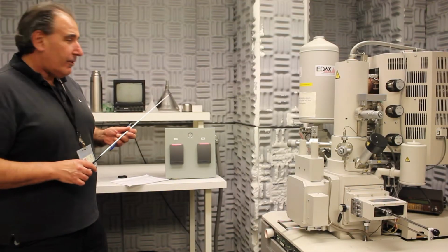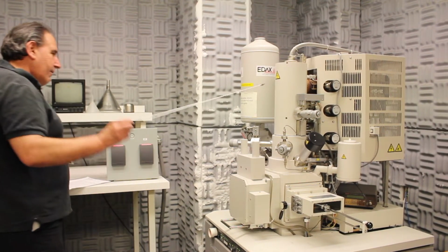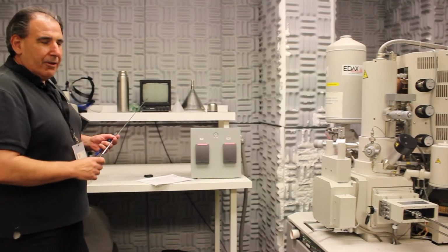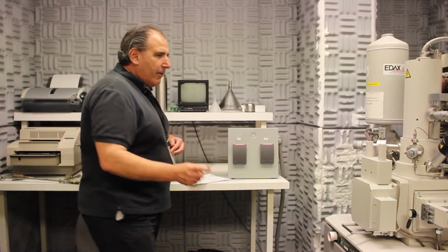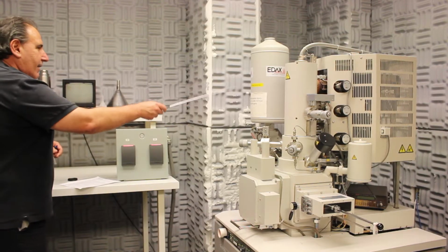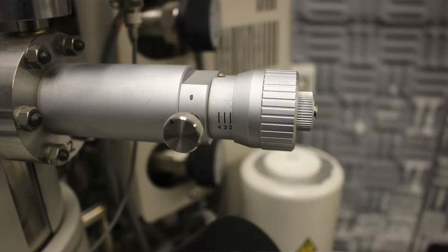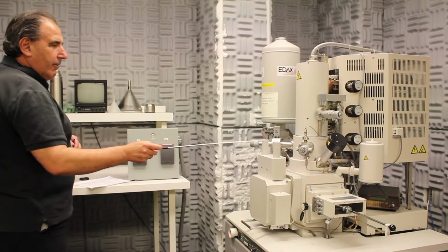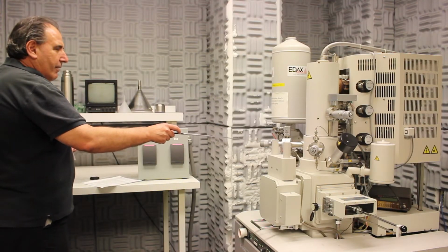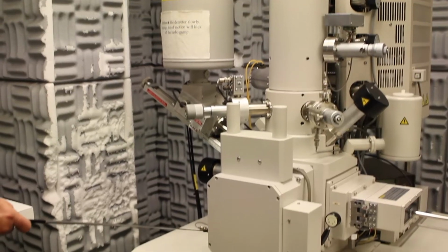Alright, checking column defaults. This is the cold trap, which we don't use anymore. The infrared camera back here and the monitor need to be turned off. The pico ammeter, off. The EDX detector should be in position 6, extracted. The beam monitor aperture is either 2 or 3. The objective aperture is either 2 or 3. The Faraday cup should be out and the switch set to meter. And finally, check that the bias cable is connected.